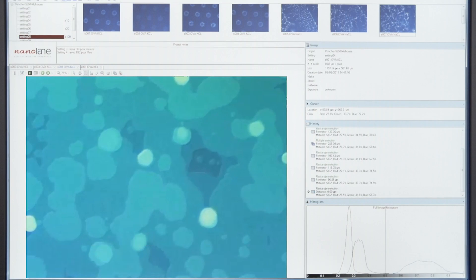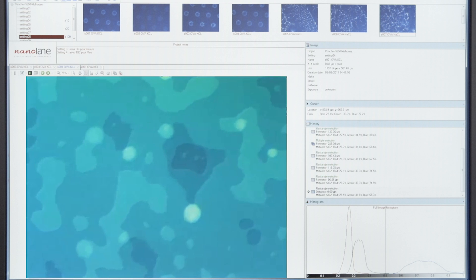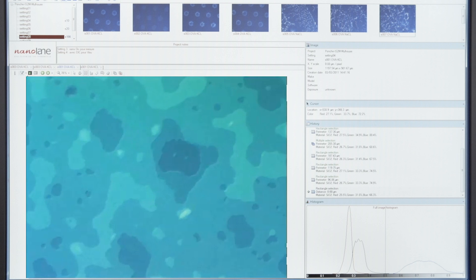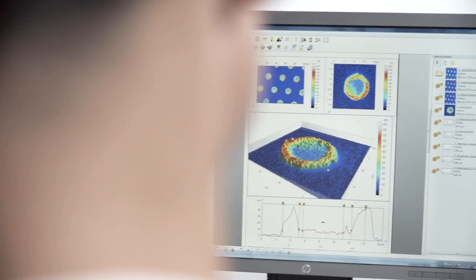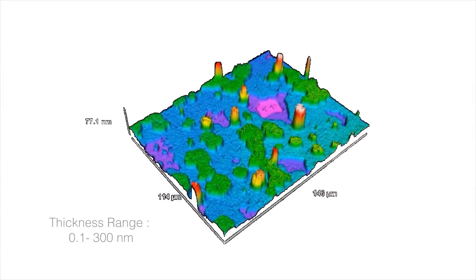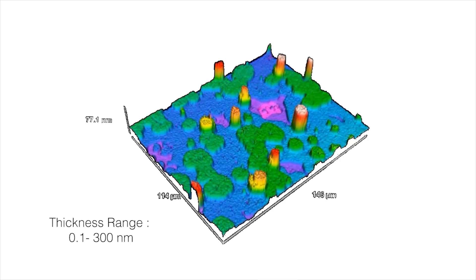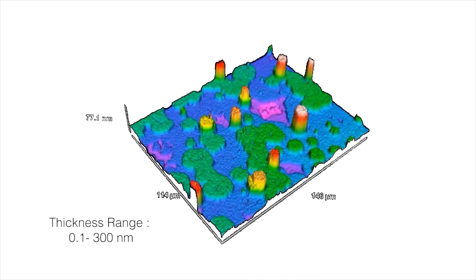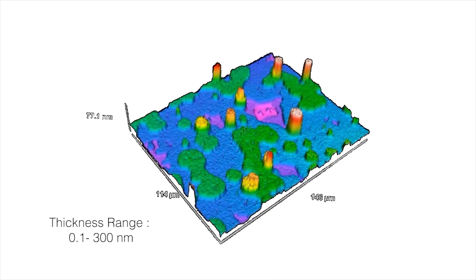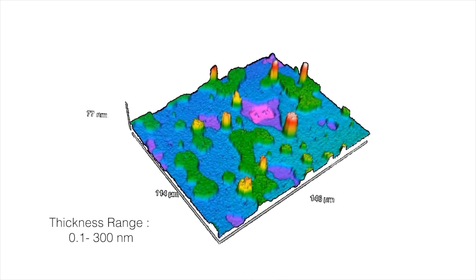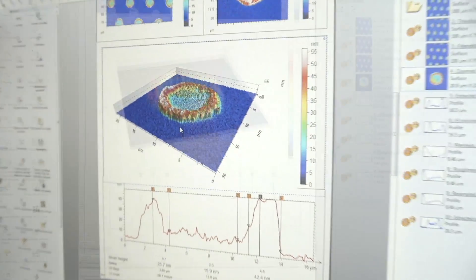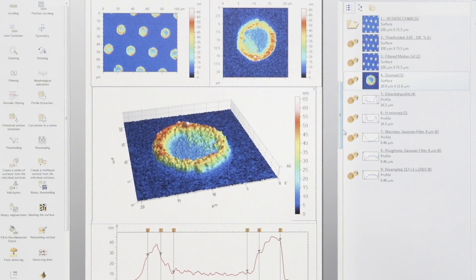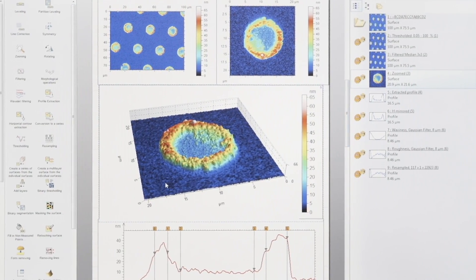The Surface HR station comes with a powerful software solution for live imaging acquisition and topographic analysis. NanoLane solution includes a complete range of 2D and 3D image processing tools such as profile section, size distribution, surface roughness, and dynamic analysis.